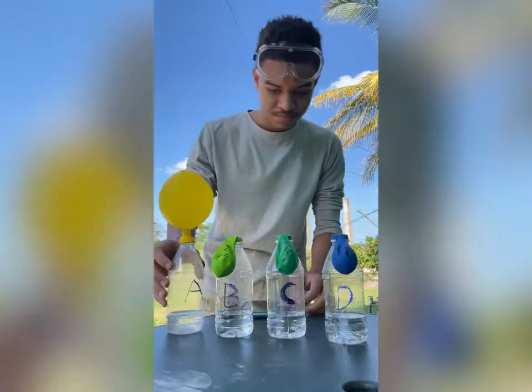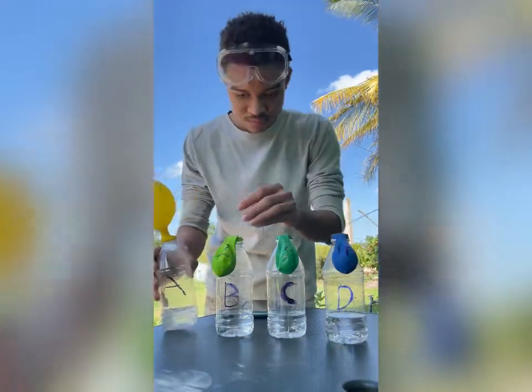Turn the bottle. Show the A, show the A. Bottle A.